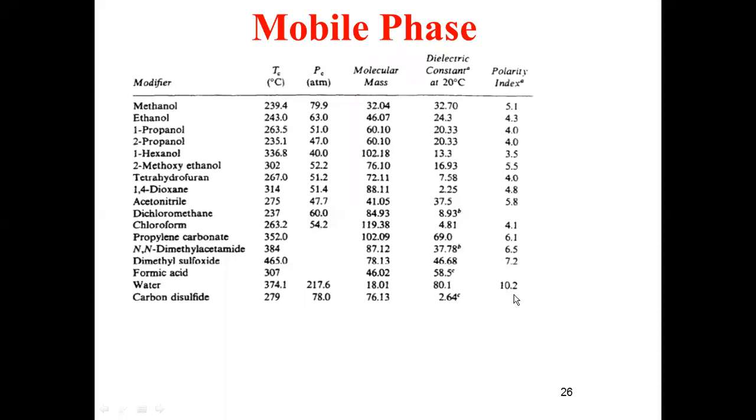Water is also present in the series, which has a polarity index of 10.2. It is a highly polar solvent. Water is a highly polar solvent. That is why it is suitable. It is called the universal solvent for the dissolution of a variety of compounds.